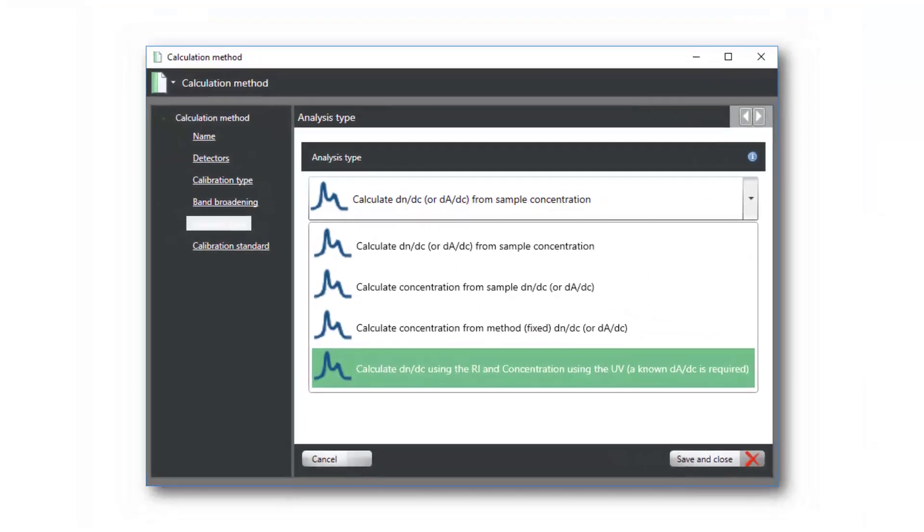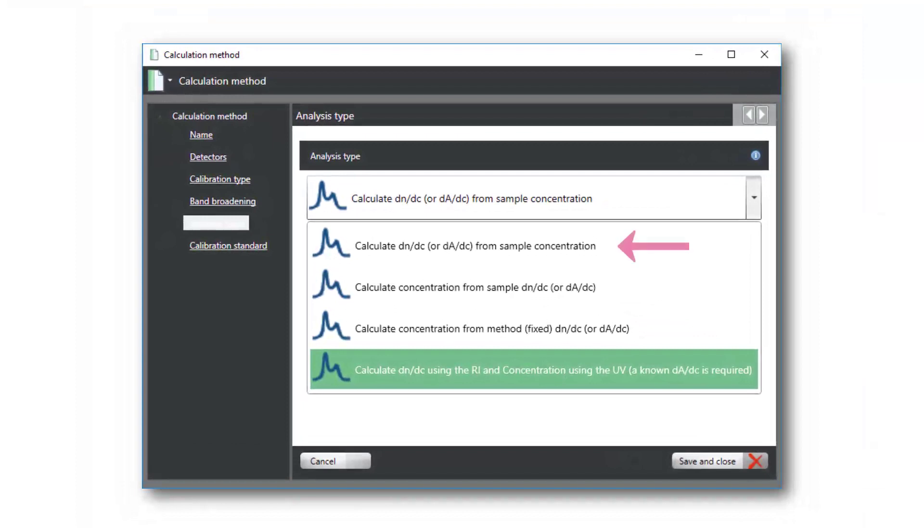The three analysis type options we'll focus on are Calculate DNDC from Sample Concentration, Calculate Concentration from Sample DNDC, and Calculate Concentration from Method or Fixed DNDC.